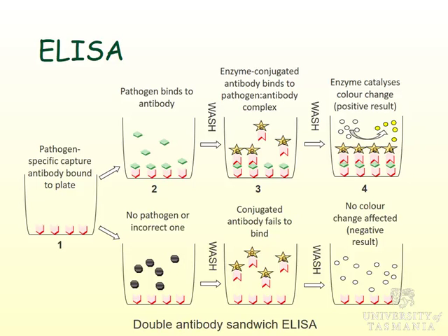So as I said, that's very useful and it's really quite useful for broad-scale surveys. Say, okay, we know cucumber mosaic virus is a big problem in our lupin crops. We want to survey for that. You can coat plates with 100 test samples per plate. You can coat a couple of hundred plates.